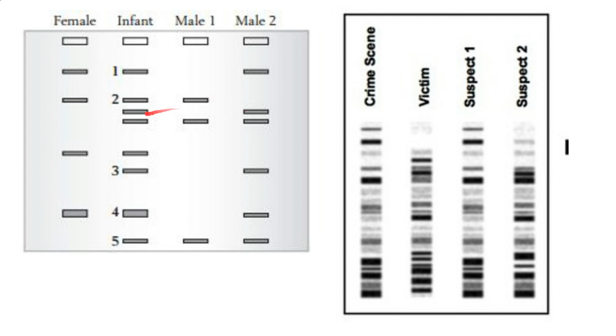This one, male 2 has, but male 1 does not, and neither does mom. So now we start thinking, hey, male 2's got something going on here. Again, this one goes with mom. This one does not go with male 1, however, it does go with male 2, and mom does not have it. This one goes with mom. This one goes here. So if you're making an analysis here, male 2 would more likely be the dad.